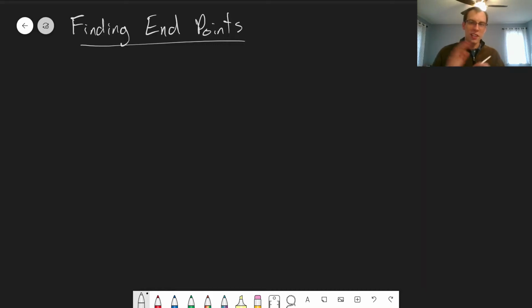Okay, we are done looking at titration curves for acid-base titration. That was a lot of titration curves. Now we're moving on to when we're actually doing a titration: how do we find the endpoint? You've done this before, but let's talk about the choices that go into this.